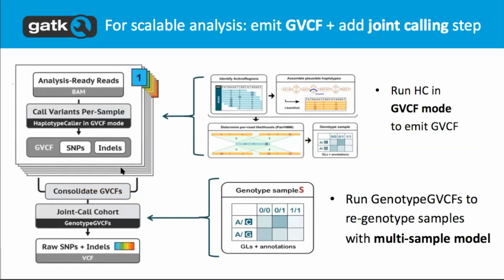I have a question, and I'm not sure if I understand correctly. We have these Phred scores at some point, and then we recalibrated them, and then at this point we have recalibrated Phred scores for every genotype in the alignment, and now we are fine-tuning in some of the places where entropy is higher, and the rest of them we keep untouched.